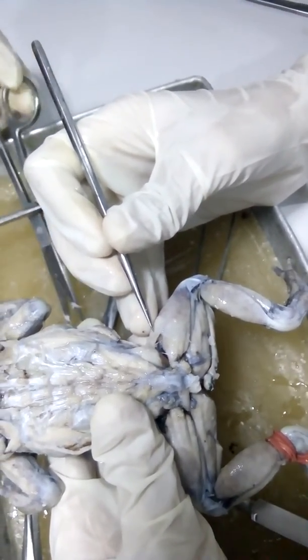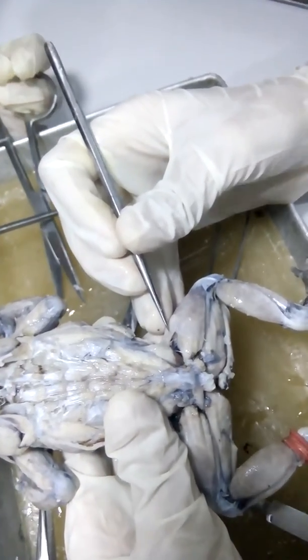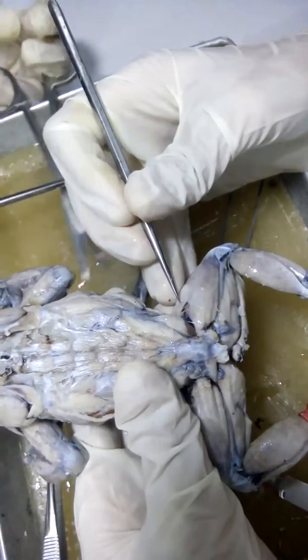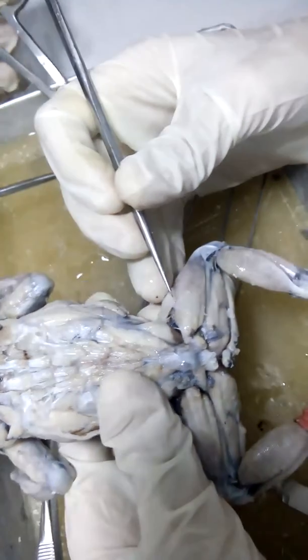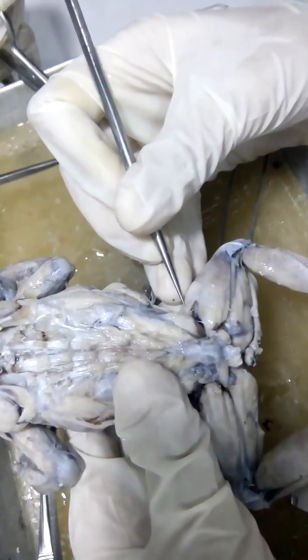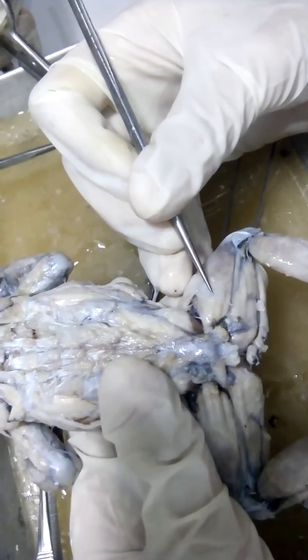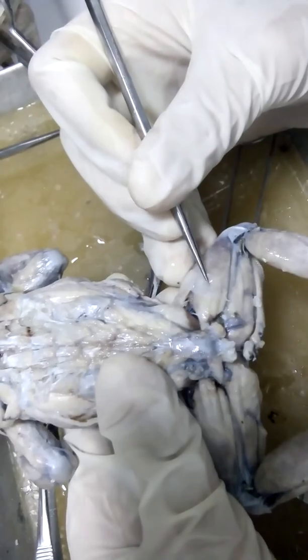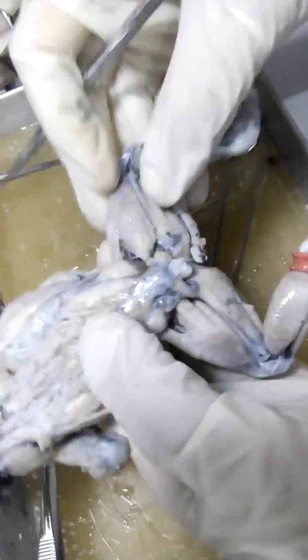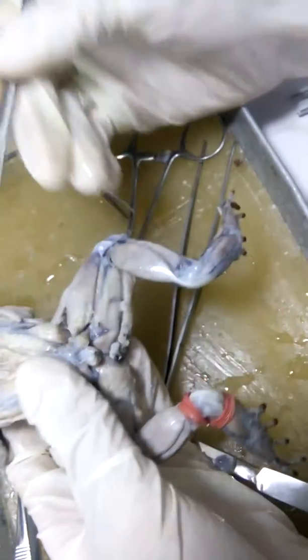Rectus femoris, anterior rectus. Sige, i-check na balik. So this here is your RFA, the dorsal part, and posterior to that is your vastus externus, because external man siya. And then if we go ventrally, this would be your vastus internus. So that's why it's triceps femoris siya.